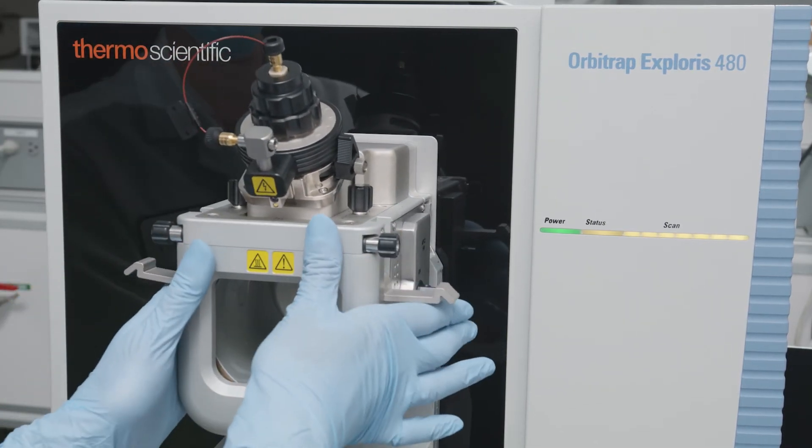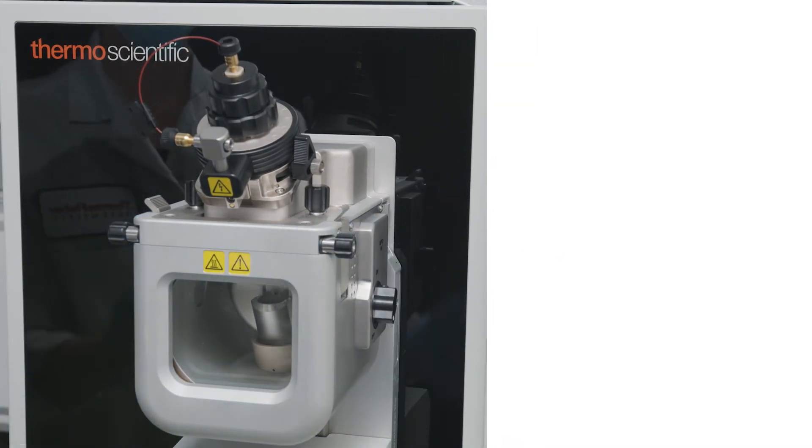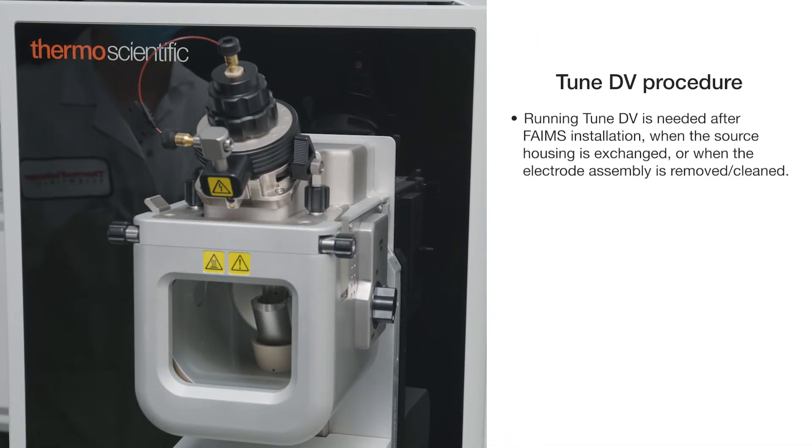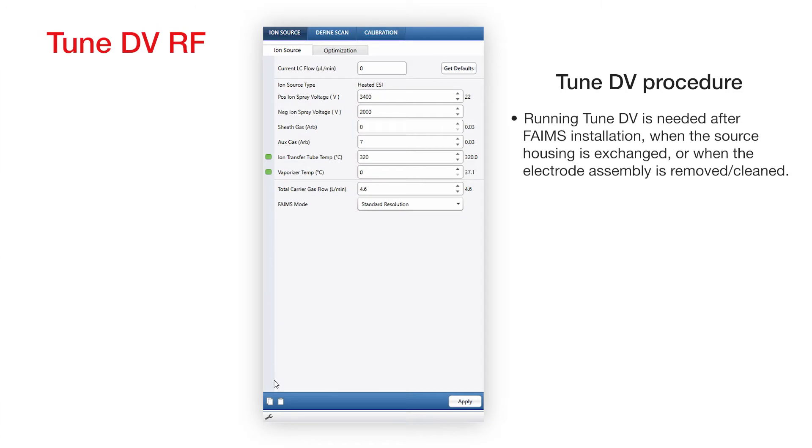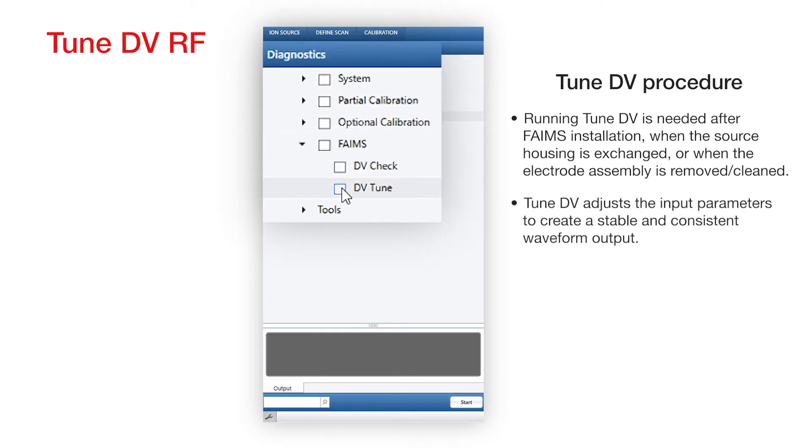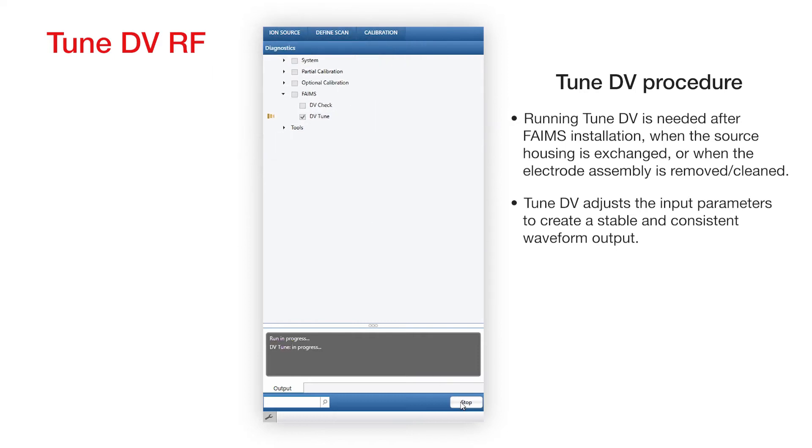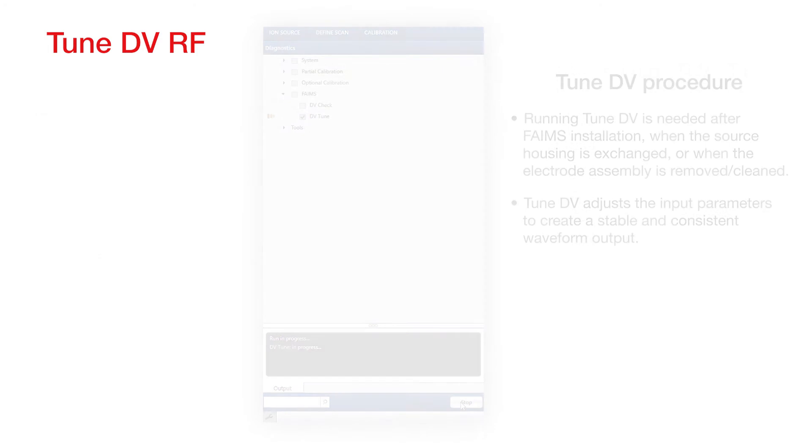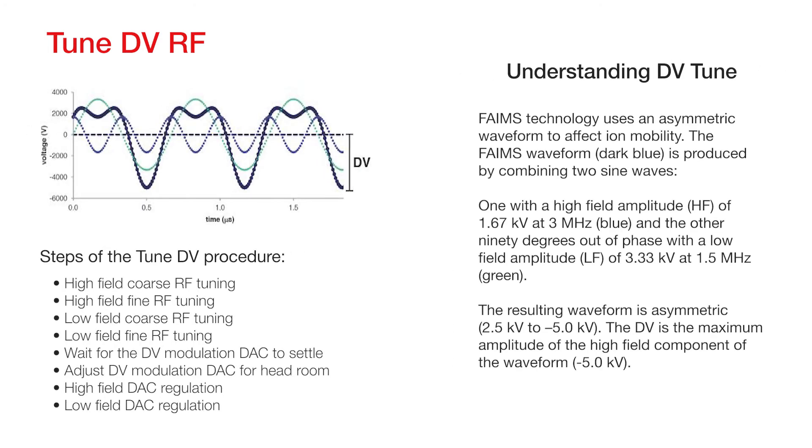install the ion source and run the TuneDV procedure. Running TuneDV is needed after FAIMS installation, when the source housing is exchanged, or when the electrode assembly is removed or cleaned. TuneDV is located under the diagnostics tab in the interface. This process adjusts the input parameters to create a stable and consistent waveform output. FAIMS technology uses an asymmetric waveform to affect ion mobility.